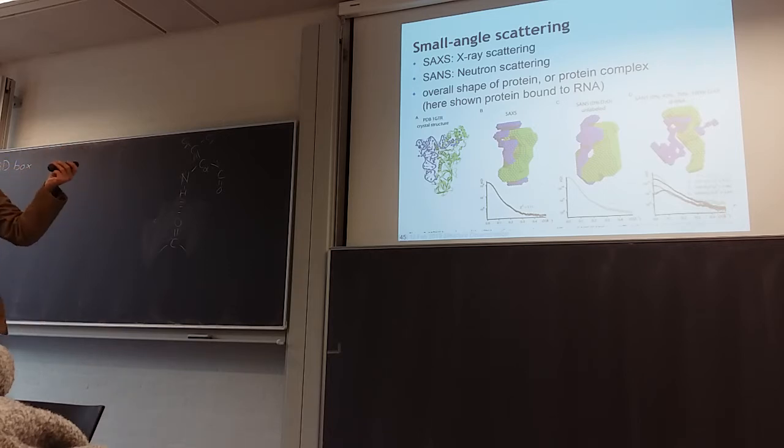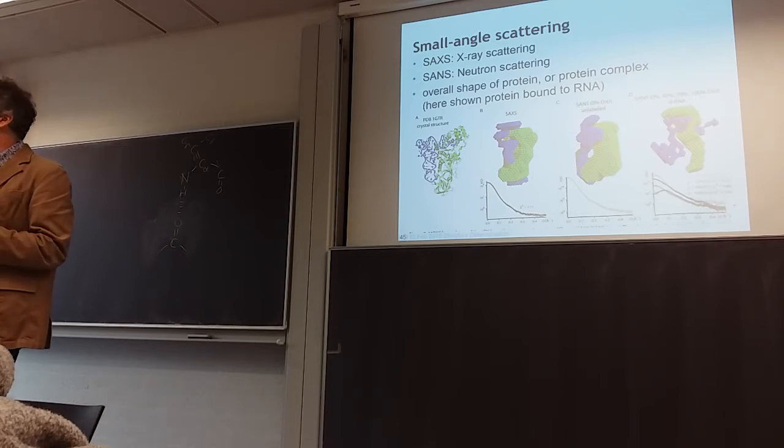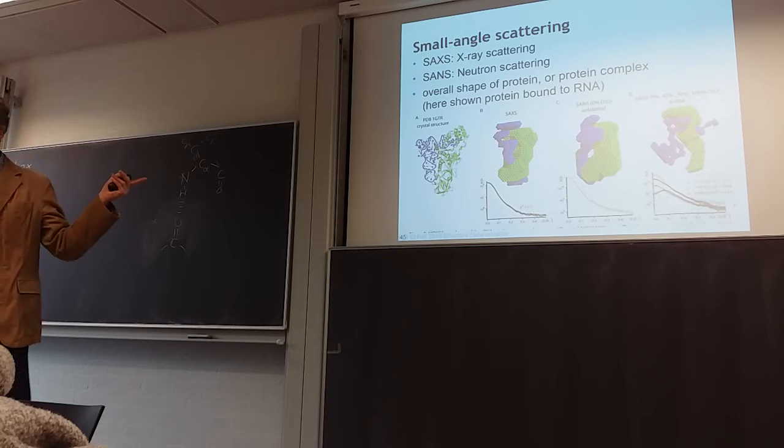The other thing is, this is again not crystallography. It's X-ray or neutrons. Actually, you can do it with electrons as well. You can do scattering, and that's really like physical scattering. It's like playing billiards, but with blindfolds, and you don't know what you're shooting at. But if you know where the balls are hitting the wall, and you do that often enough, you can get a rough vision of the shape of the thing that you are shooting at. This is almost exactly what happens in the experiment.